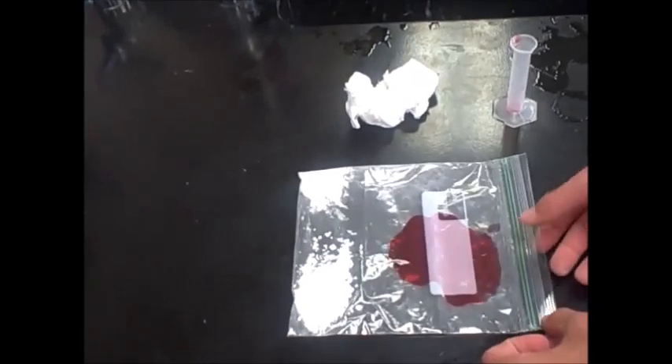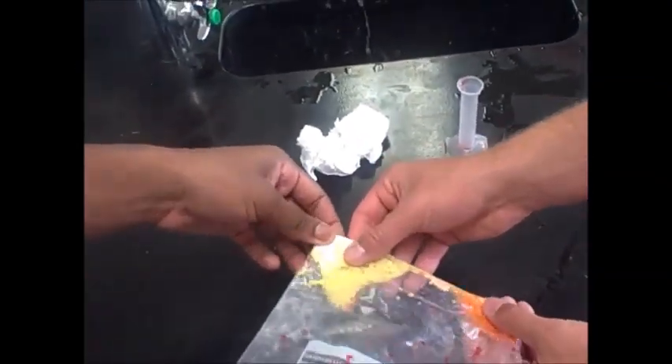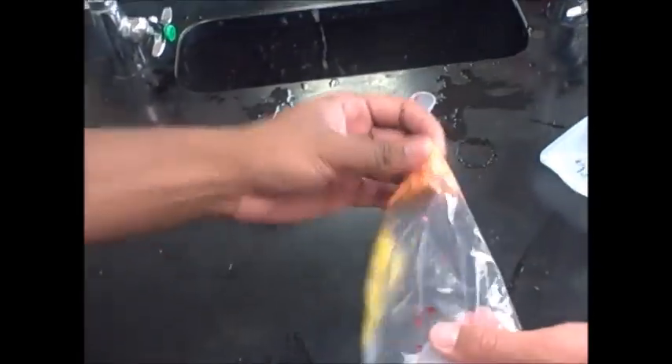Mix it all together now. We're mixing everything together now. Everything together, you gotta feel it. Yeah, it feels warm. What about that side? Feels normal. Yeah, this is really warm. Wait, yeah, it's like hot.